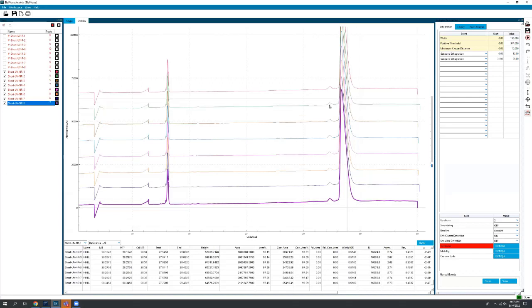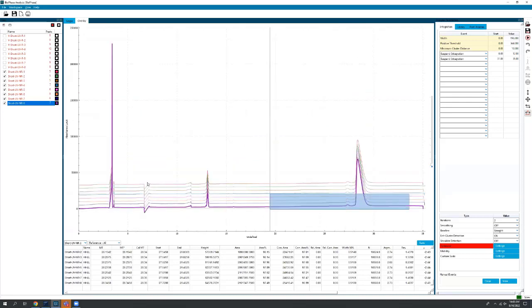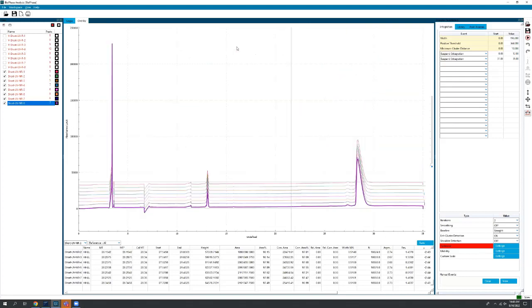We're also very close to what the mAb C of A is telling us it should be. If we look at the overlay, all 8 capillaries look very nice together. Zoom in a little bit there. You can see all our free light chain there. Heavy light chain most likely there. Not too much going on in the region of the half antibody. A little bit of this 100 kilodalton form. But all in all, that looks pretty good.